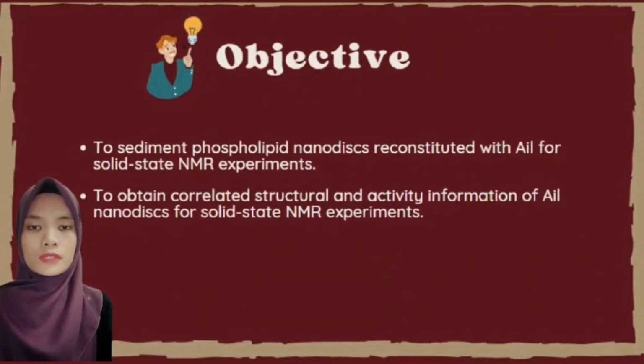There are two objectives for the solid-state NMR experiments. The first one is to sediment phospholipid nanodiscs reconstituted with Ail for solid-state NMR experiments. The second one is to obtain correlated structural and activity information of Ail nanodiscs for solid-state NMR experiments.